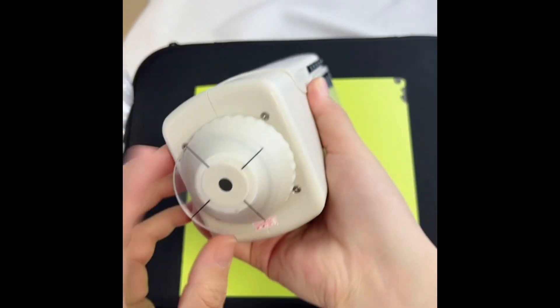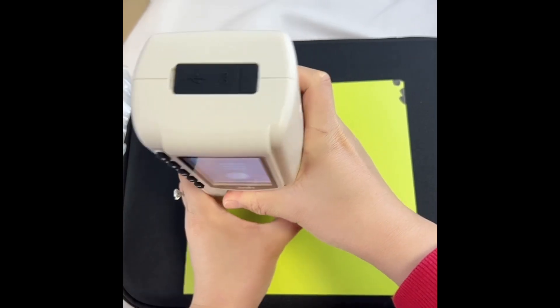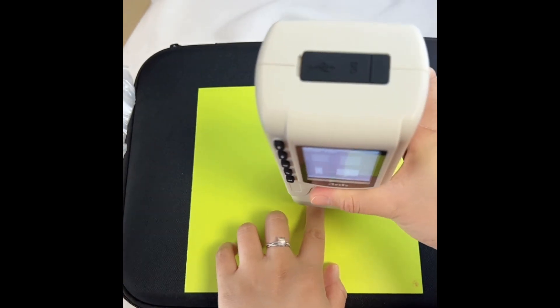Charger aperture. First we need to measure one sample — we measure here. And then switch to sample, we measure another side.